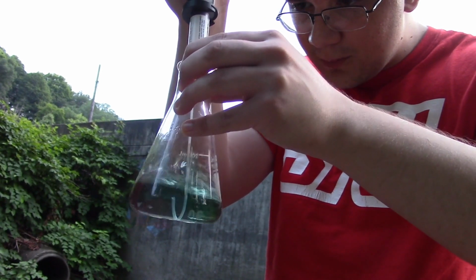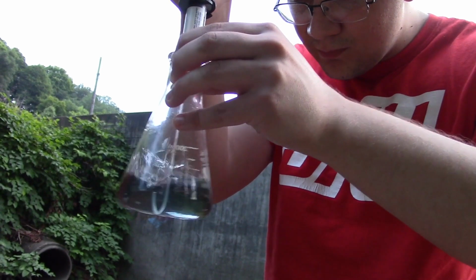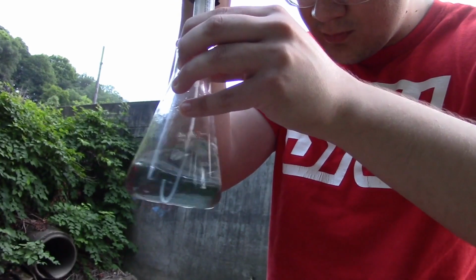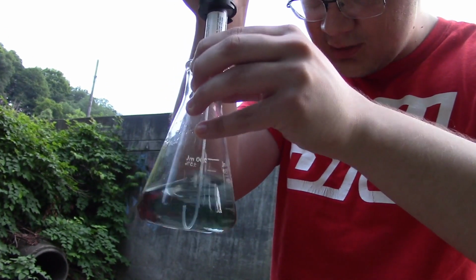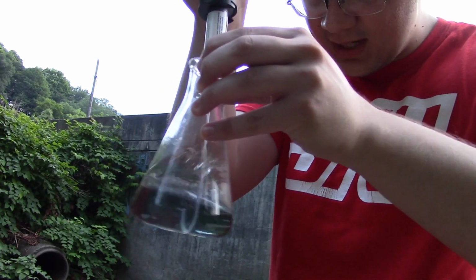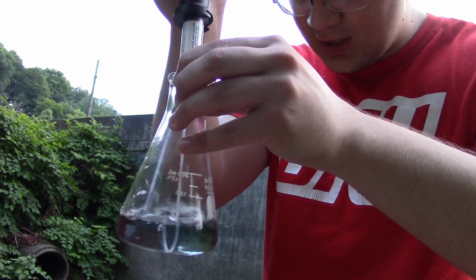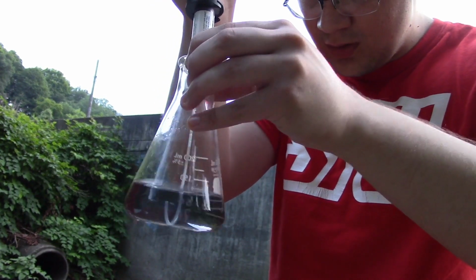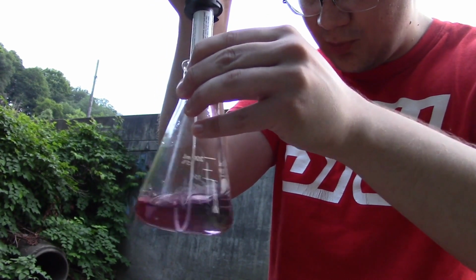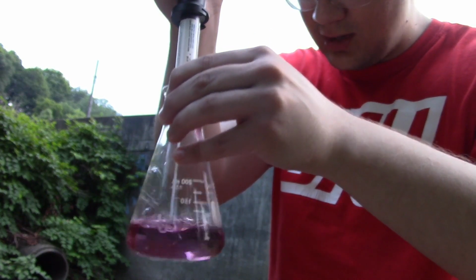There we go, there's a little bit of pink. You see that? And so we're waiting until this turns pink and stays pink. But as I release this in here and I shake it around, oftentimes you see it slowly fades out. So we know once it stays pink, that's when we've reached our end point. Looks like we've got it. Aha, there we go. Nice.